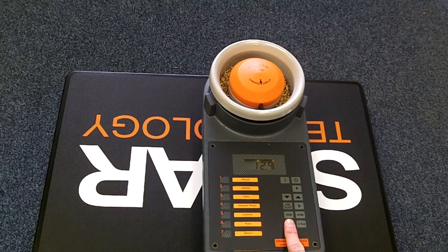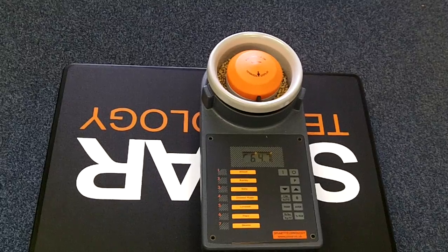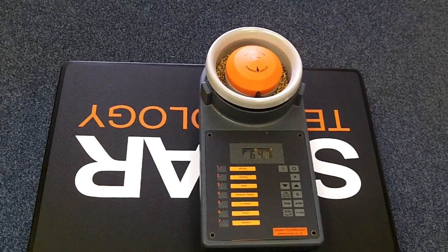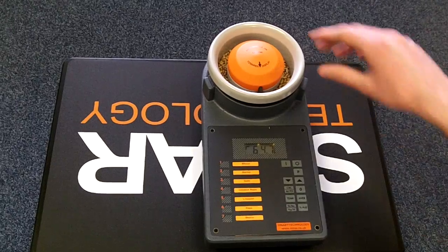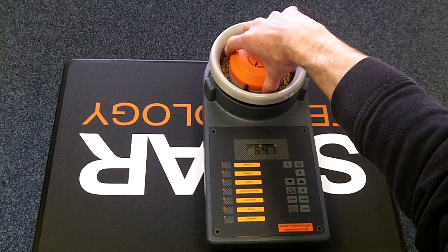Now press the kilogram per hectolitre button and the result should be between 64.0 and 65.0. So this machine is working correctly. Remove the sample from the sample cell, turn the cell to the seven o'clock position, and lift gently.